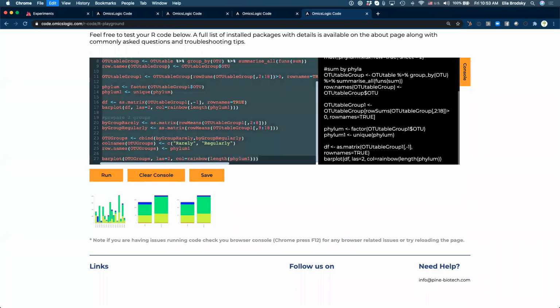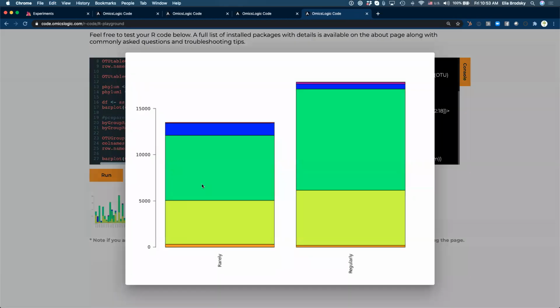Again, just so you can try it, and this will be as a lesson / tutorial also. But this is a very simple code that allows us to group our information by mean values between the groups and try to compare them to each other. So obviously here, we don't know what all the information is, and we need to know what the colors are. But even if we add the colors, there's quite a number of different colors here, right? There's all kinds of colors here up top.